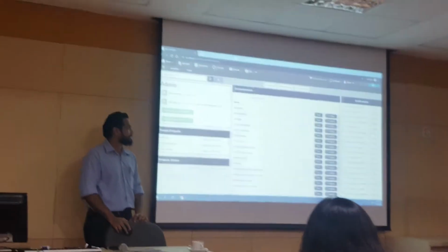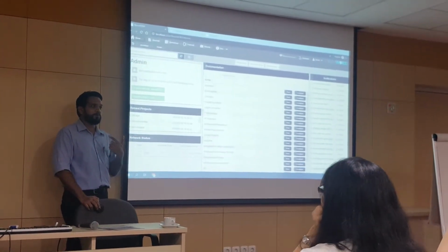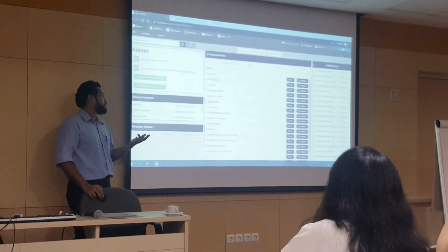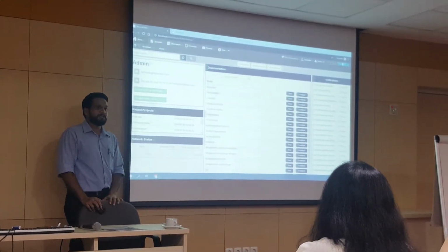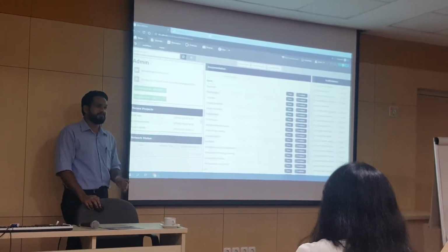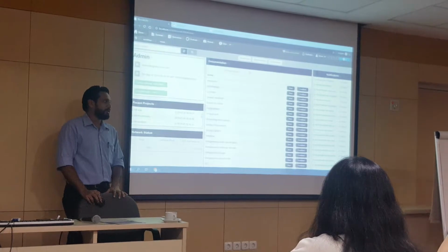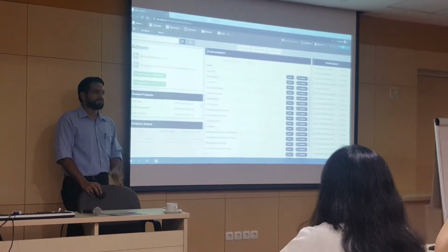Within novoWorx, like I said, there's 4 steps. So your data upload, your project creation, your protocol selection, and also your project running. So what I'm going to do today is I'm just going to go through all of these steps very roughly, because we only have about 15 minutes. And if you have any questions, then you can ask them at the end of the session. Sounds alright?